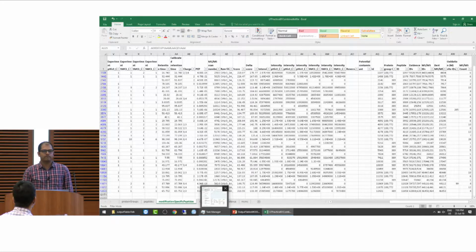So my question is, when you have done a large comparison and you've identified a handful, say 5, 6, 10 proteins that you're interested in, and you want to go back and verify with another piece of evidence. So you have your proteins. Which table do you go back to and say, okay, I've got 3 peptides here, 6 peptides there? What are you going back to, to convince yourself that your changes are correct?